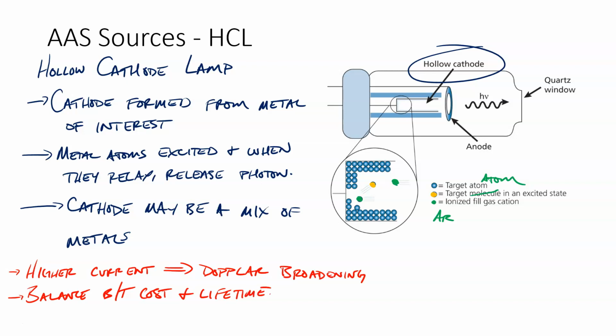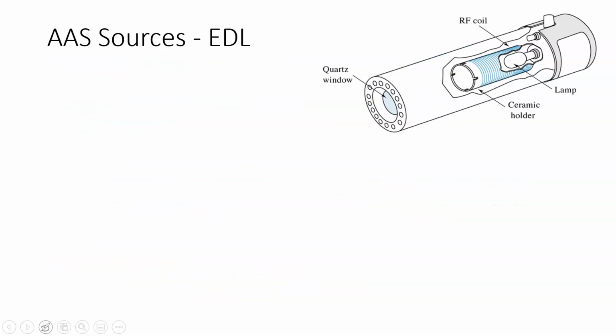Now, there is another variety of source. Unfortunately, we don't have this one at Wofford, so I don't have one to show you, but this is a pretty good schematic. This is not from our textbook. What you have is an enclosed cylinder, so you really can't see what's going on, even if I did have an example to show you.